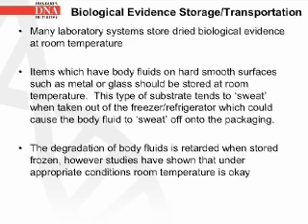Many laboratory systems store dried biological evidence at room temperature. Items which have body fluids on hard, smooth surfaces such as metal or glass should be stored at room temperature. This type of substrate tends to sweat when taken out of the refrigerator or freezer, which could cause the body fluid to sweat off onto the packaging. The degradation of body fluids is retarded when stored frozen. However, studies have shown that under appropriate conditions, room temperature is okay.